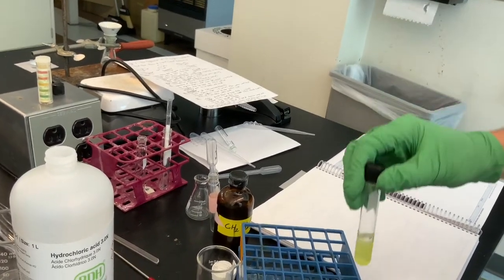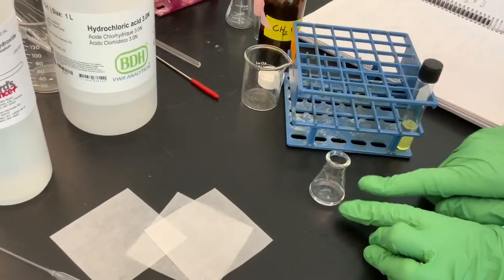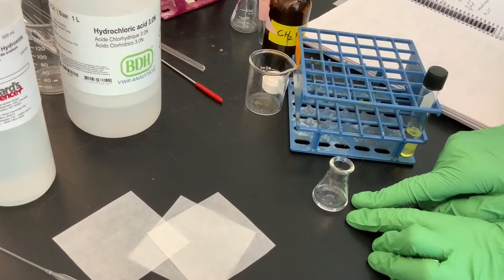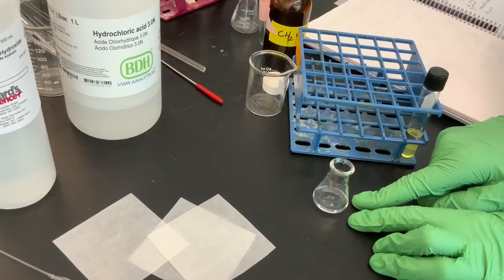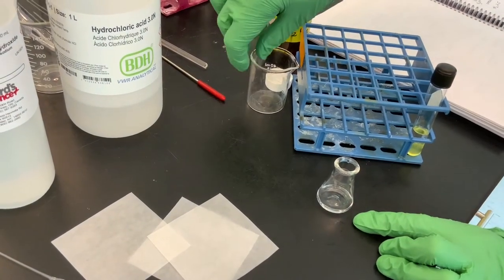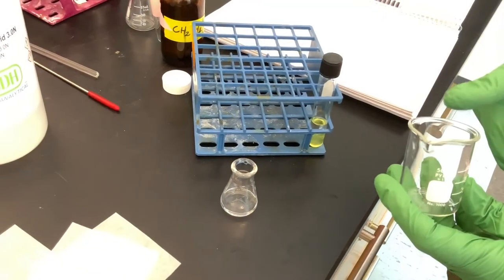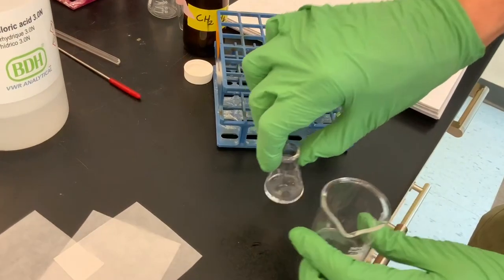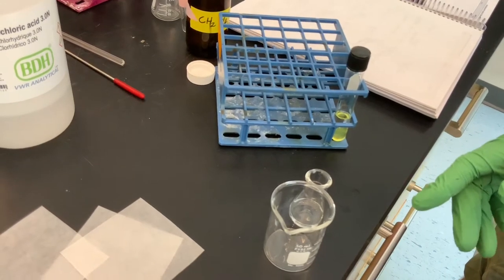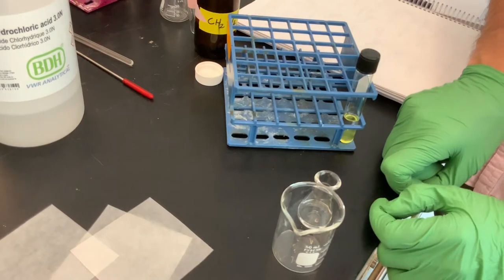All right, we'll let the two layers separate. And I'm using the same pipette to then add it to our 10 milliliter Erlenmeyer flask. And in this, we are going to place this in an ice bath in the interim. And so I'm going to use a 50 milliliter beaker to make an ice water bath to nestle the 10 milliliter flask in it. So what that's going to do is decrease the solubility of our benzocaine, which we ultimately want.